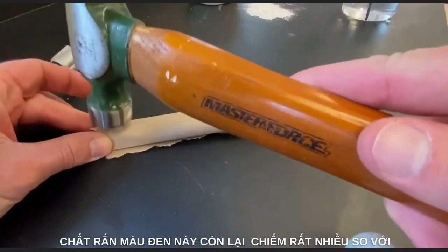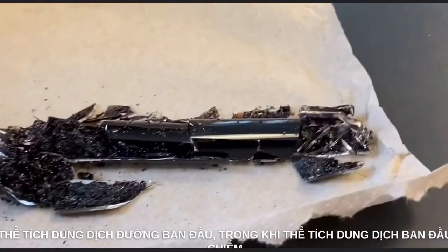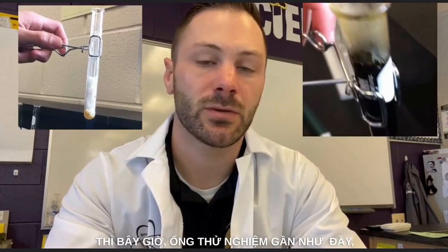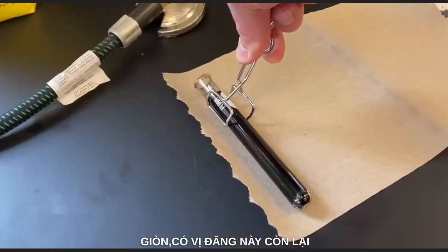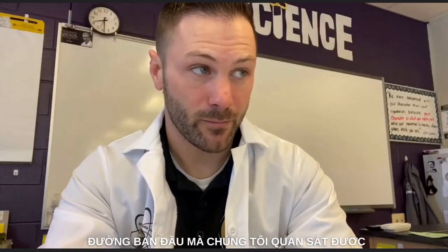Afterwards, we broke open the test tube and we saw that this black stuff left over took up a lot more space than the sugar ever did. While the sugar took up about 1/3 of what was in the test tube, now the test tube was almost completely full, in some cases overflowing, with this solid, flaky, bitter-tasting black stuff, which was a lot different than the original properties we observed from the sugar. Okay, so what's going on here?